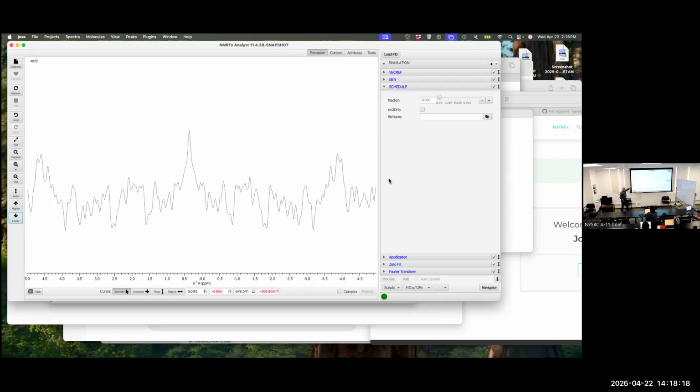I'd like to say that this is not noise. All this stuff that looks like noise is actually your signal. Imagine that you take a beam of light and you shine it through an aperture, and the light now spreads out in some diffuse pattern. That spread out light was actually the light we started out with. It just did not go straight through.